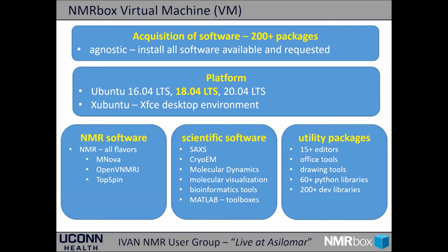So the NMRbox virtual machine, what is in it? First of all, the acquisition of software. We have over 200 packages available inside the platform, and we tried to be very agnostic. So we're not picking our favorite software. We're essentially installing all the software that we have access to, and which we have time to install. And primarily the installation now is being driven by requests from the NMR users themselves.